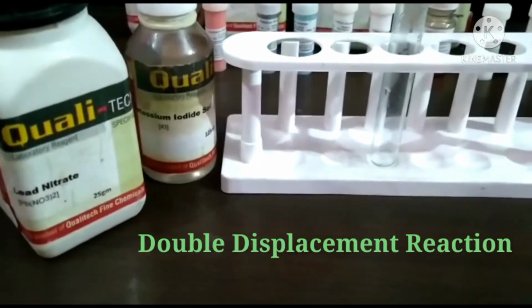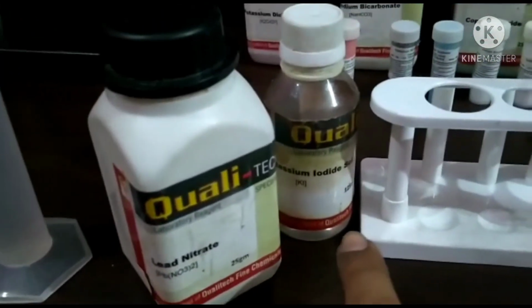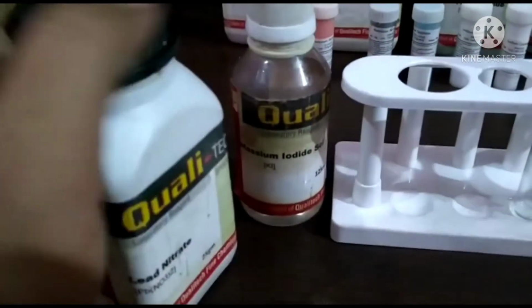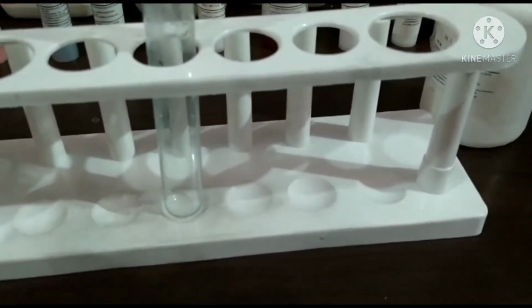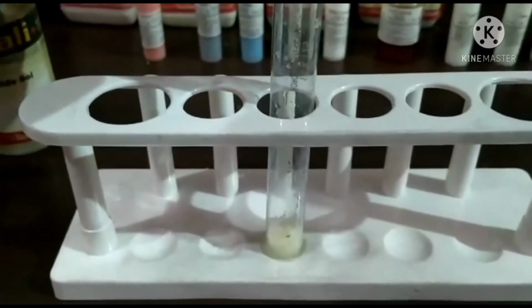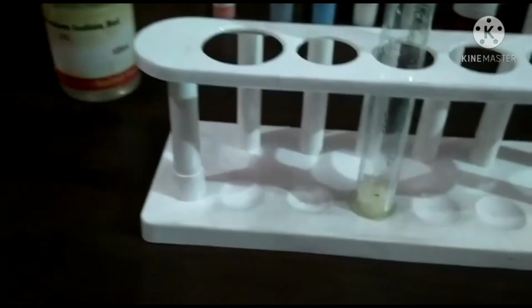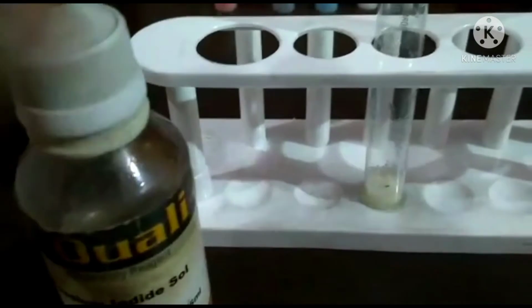We have another double displacement reaction between lead nitrate and potassium iodide. This is lead nitrate and this is potassium iodide. Both are colorless. First we will take lead nitrate to the test tube. This is colorless, so we will take it to the test tube. Okay, so we have taken the lead nitrate to the test tube. Now we will be adding the potassium iodide to the test tube.